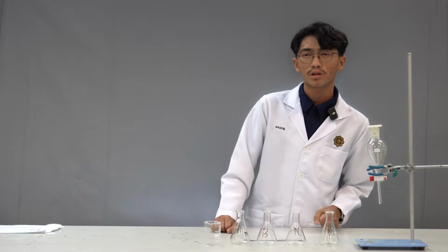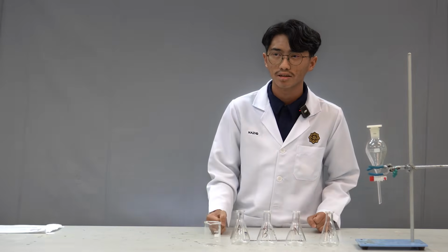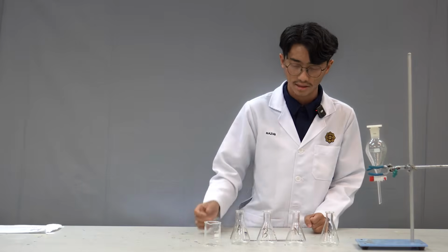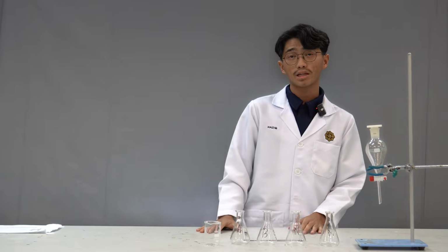Why the liquid extraction principle is convenient, and why industry must use it, is because by using the principle of liquid extraction, the process is not temperature dependent.